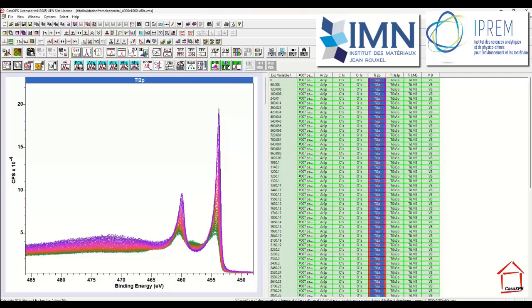So we're going to put together these options by considering not just the titanium 2p, but we're also going to include the oxygen 1s, because we can interpret the titanium 2p better if we watch what happens to the oxygen at the same time as we allow changes to occur using the difference option between the titanium peaks. Since I want to combine the oxygen 1s and the titanium 2p, the first thing I need to do is construct a new data file that contains just these two pieces of information. And they must be in a form that I can then apply PCA, etc.